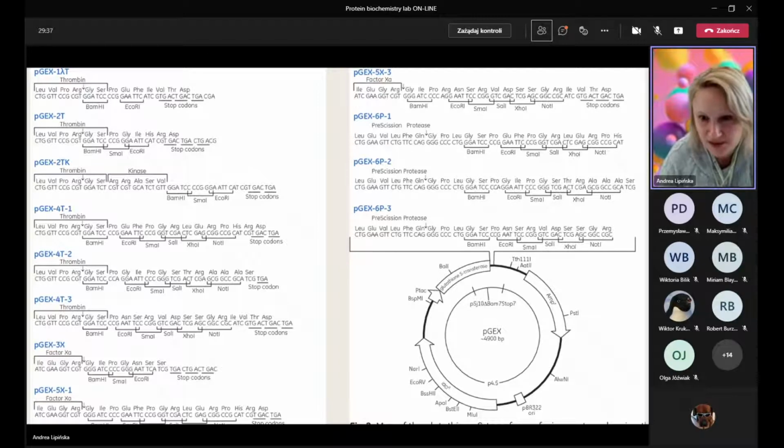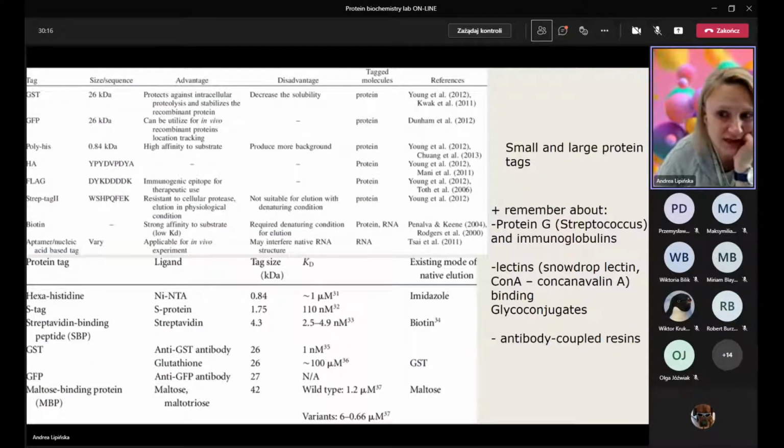Okay, so as regards the fusion, again, in pGEX, we have the tac promoter. There is a Shine-Dalgarno sequence, which we do not actually see at the beginning, to ensure proper translation of GST. And then in frame, we clone our gene of interest, either with its own stop codon, or, in our pGEX for example, we have 3 stop codons in 3 different open reading frames, so the translation should always be okay.